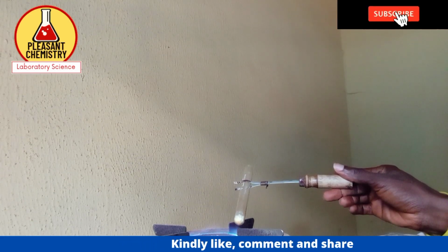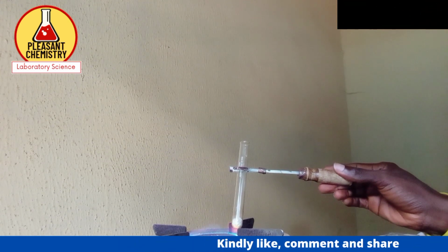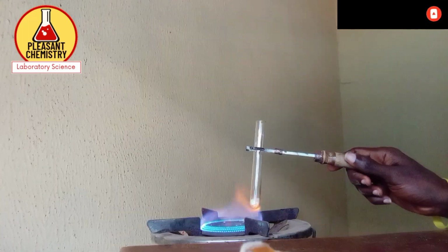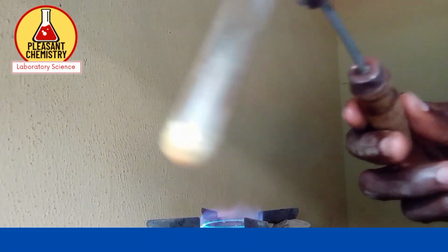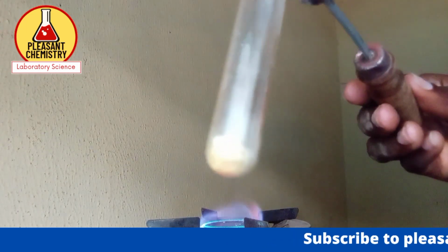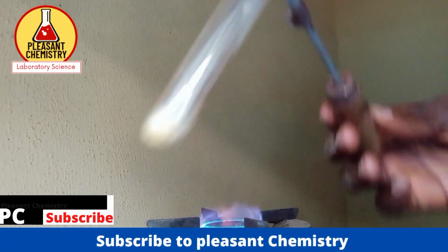There is an effervescence, something that looks like boiling inside that test tube. So we are still heating. So let's check. The color of my sample D is now changing. The color is changing gradually. Initially the color was white.